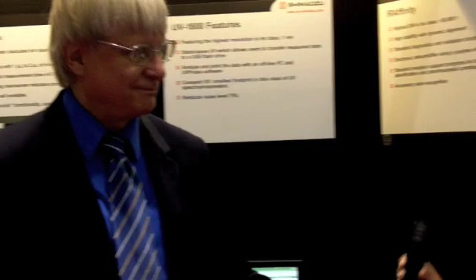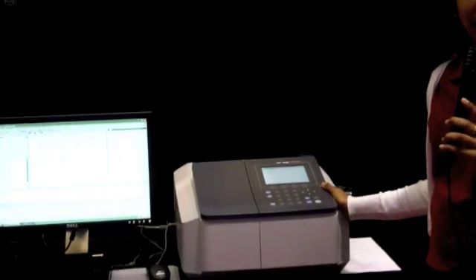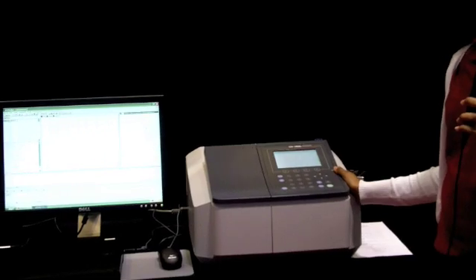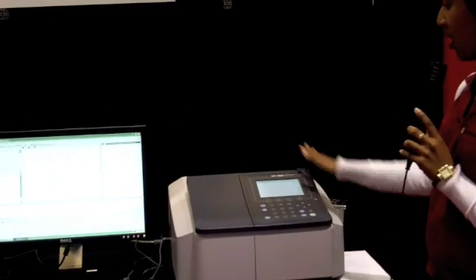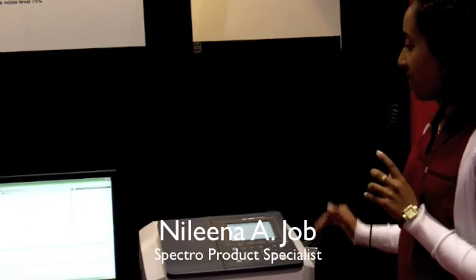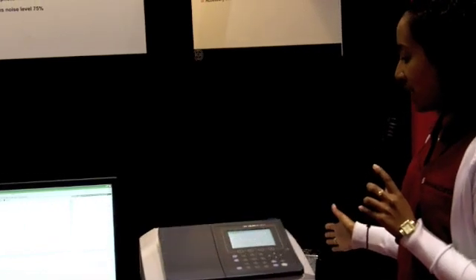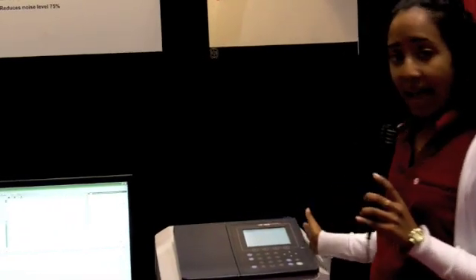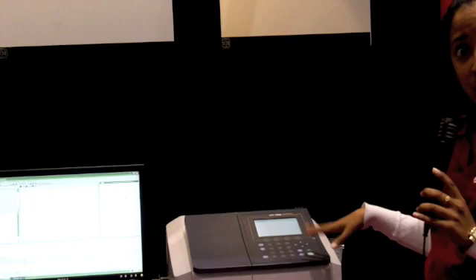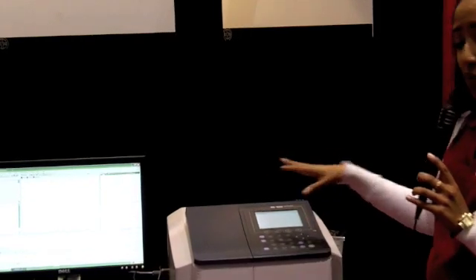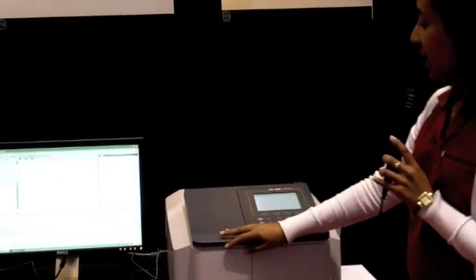Thank you very much. So this is Shimadzu's most common model for a UV-Vis spectrophotometer, the UV1800. One of the nice things about the instrument is that it's really compact and lightweight. It doesn't weigh too much to move from place to place.